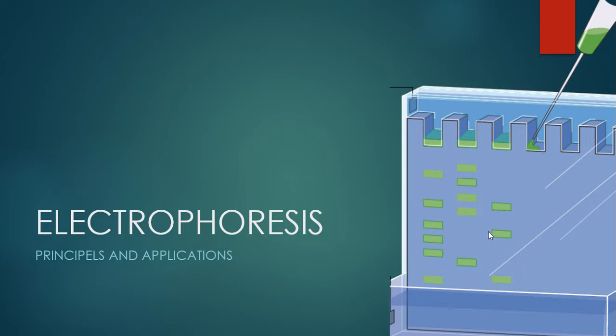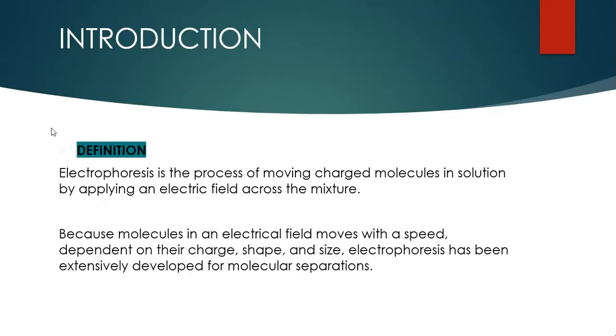Okay, so the separation of molecules we had seen in a technique called chromatography, and this electrophoresis is an advanced form of chromatography. So you can go through the chromatography topic that is already there in the other videos. Okay, let's come into the topic of electrophoresis principles and applications.